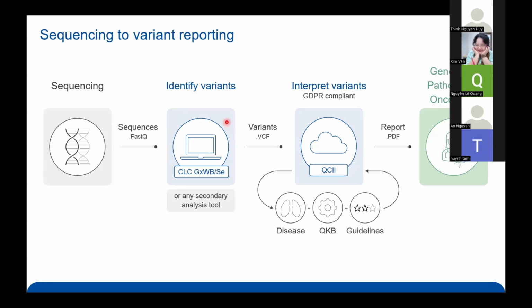So yeah, that's also a very good question. It depends on how many samples you are doing per month. How many samples turn out per month? That's one thing. How big is your data? Are you running small panels? How much GB, whether you are converting 100x, 200x into 2 GB, 3 GB data? How much complexity is there? Those things decide how much usage you need.